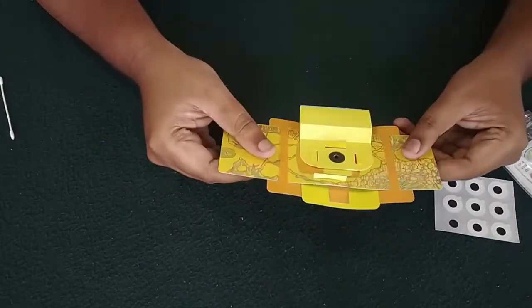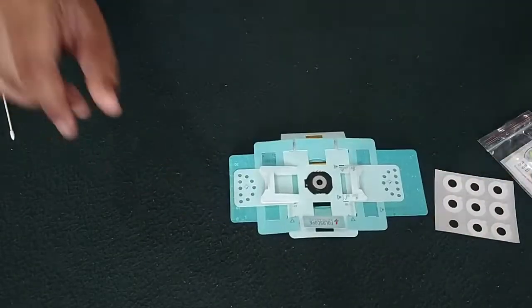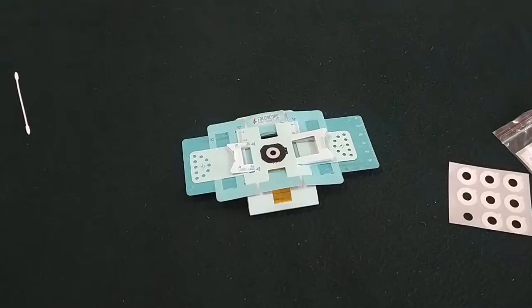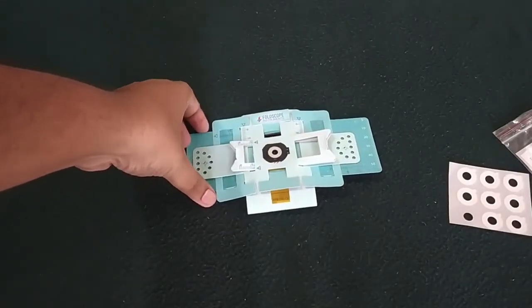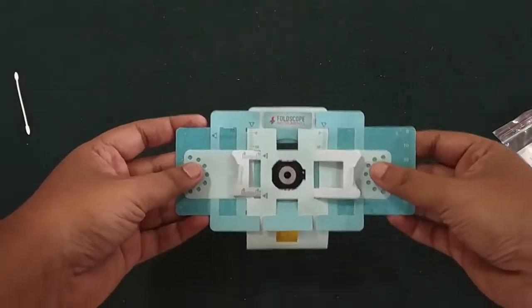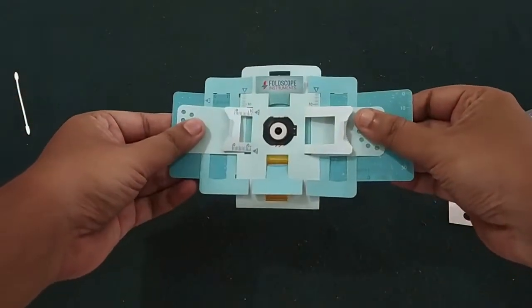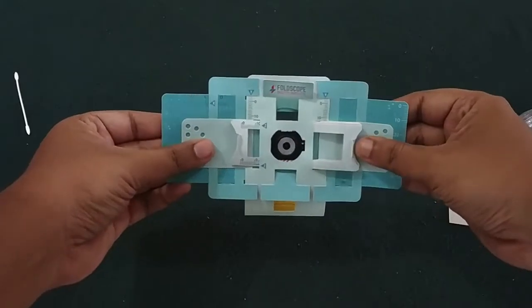So here is our foldscope ready. Friends, this is the foldscope. After assembly, it looks like this. It can easily be moved up and down and left and right.